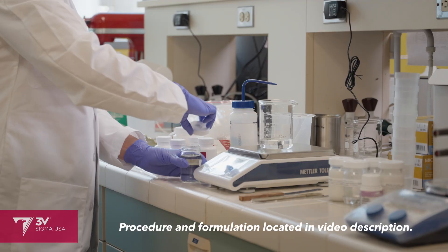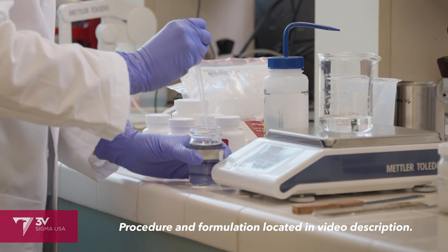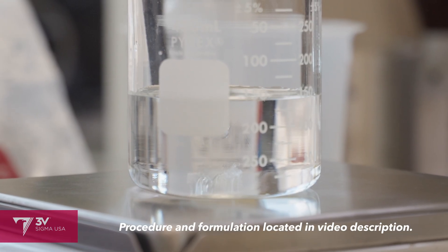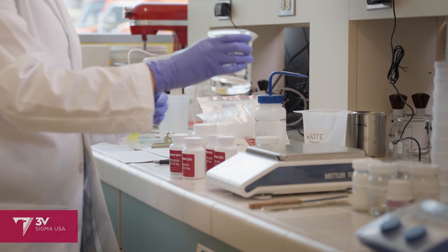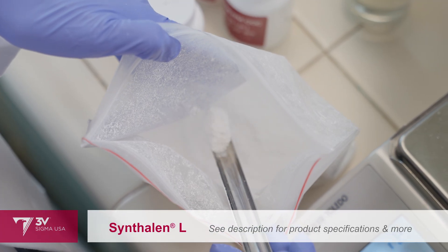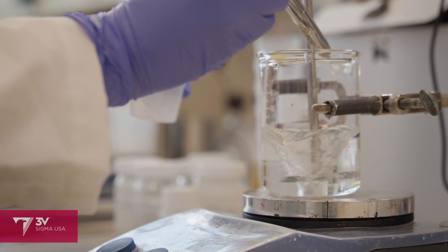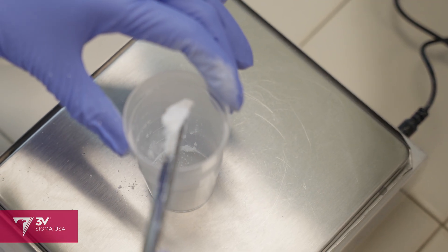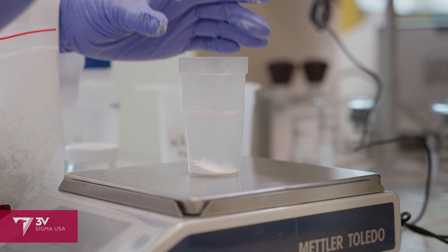I'll start with the water phase. To the deionized water, I'm adding a biodegradable chelating agent and then slowly sprinkling in Syntholin-L. This is one of our carbomers with low viscosity build but high yield. It will keep the mineral actives in suspension for even protection throughout the sunscreen's shelf life, and once it's initially dispersed, I'll begin heating the batch. We can come back in about 30 minutes to an hour when it's fully hydrated.